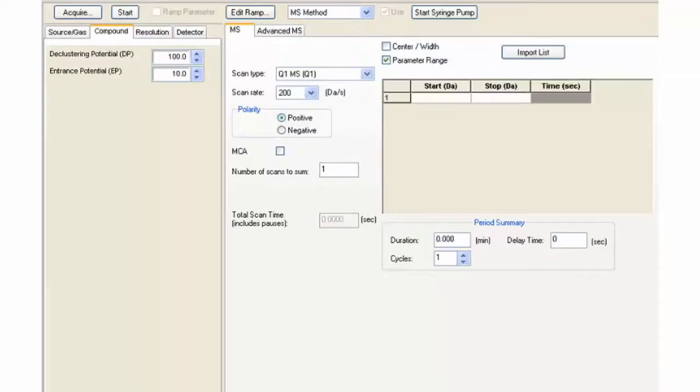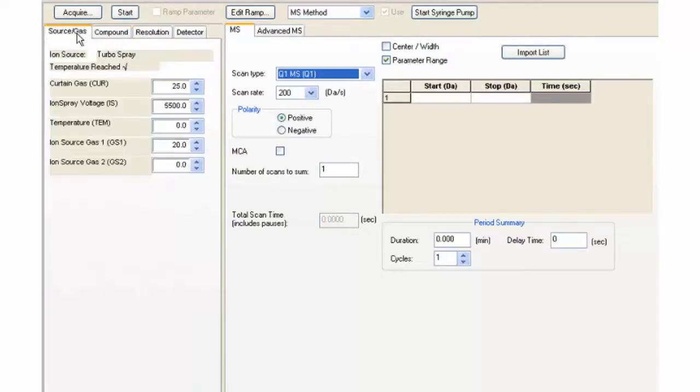Click on the Source Gas tab. This method is an infusion method, so GS2 and TEM should be set to zero.